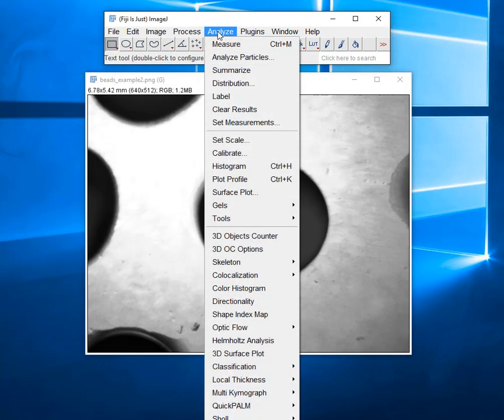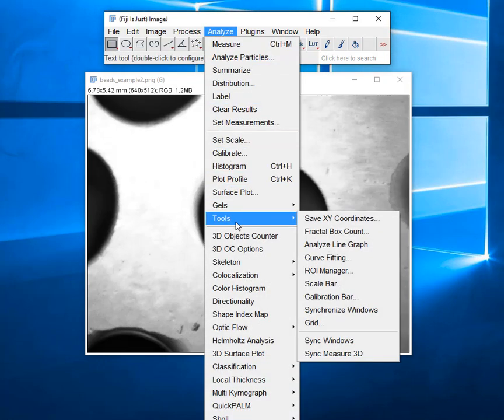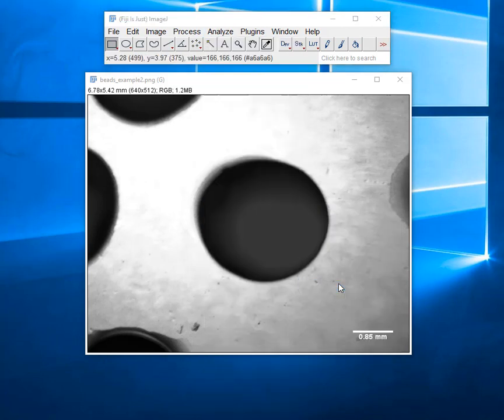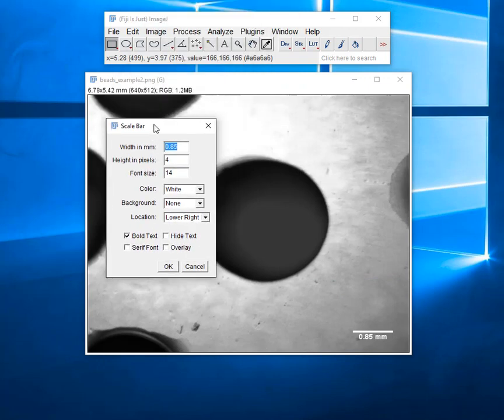And the way to do that is under Analyze. It's a little bit hard to find. It's under Tools, and there's a scale bar right there. So we just click on it. It brings up a menu.